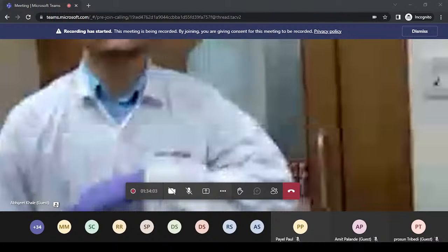So this is the area where we are keeping all the CAMAG HPTLC modules in our R&D center. Here we are only dealing with CAMAG HPTLC and related system modules. So this is the stationary phase involved in HPTLC analysis. There are more than 50 different types of stationary phases. We can choose as per the analyte of interest, any suitable stationary phase, and start with HPTLC analysis.